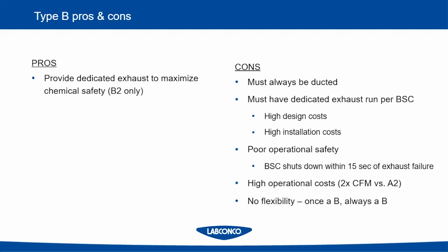The BSCs must shut down within 15 seconds of an exhaust failure. What happens in those 15 seconds before the cabinet goes into alarm? You need to make sure you do some smoke tests on your units in your facilities to make sure they maintain containment. And they have a high operational cost, and that's because of all the air that they're exhausting out of them.